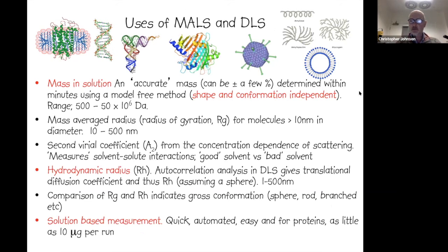Okay, so we have a question from Sissy saying, fresh buffers, there should be no light scattering, which means the laser light is visible. Is that correct? No, when you shine, in that picture, you're looking at 90 degrees. You're looking from above on the laser passing through the buffer, and therefore if your buffer is full of grot, you will be able to see the laser beam. When the buffer is not scattering at all, you won't be able to see it. I think that's certainly what you're asking. I think you probably already knew that.